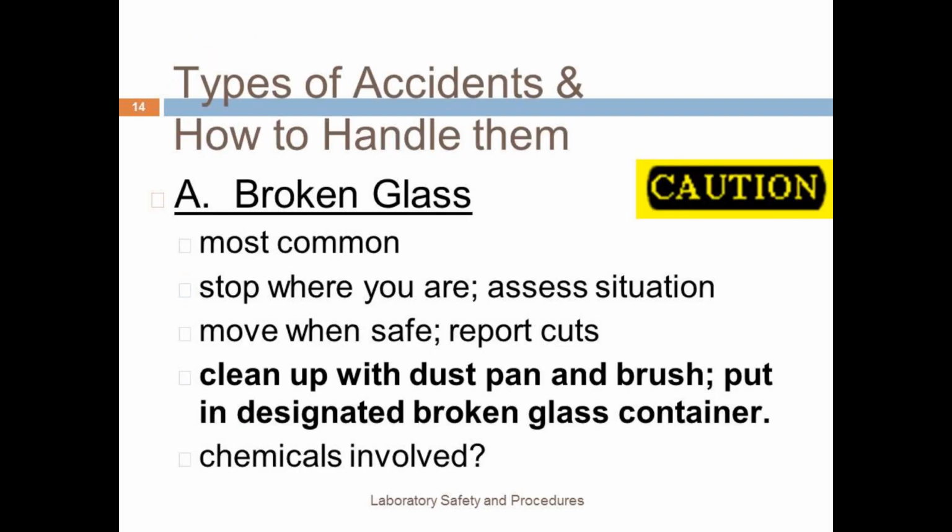The most common accident in the lab classroom is broken glass because we use glassware. Make sure that if you do break glass, that you stop where you are and assess the situation. Move away from the broken glass when safe, and report all cuts and the broken glass to your teacher. Never touch the broken glass with your bare hands.